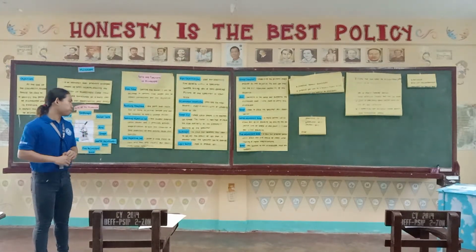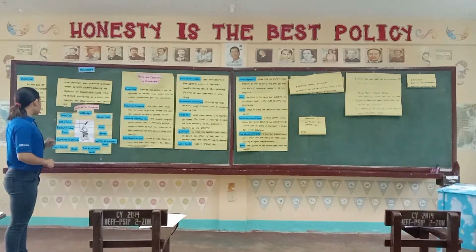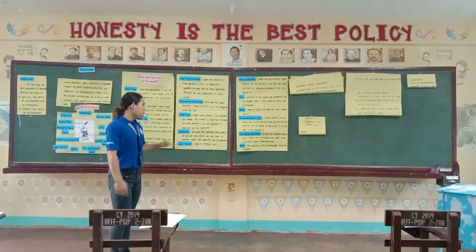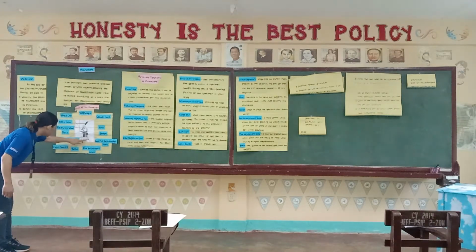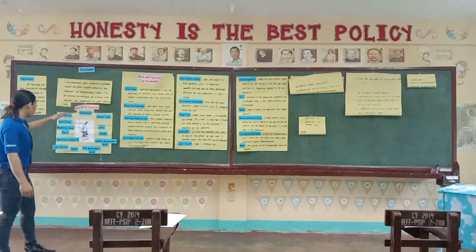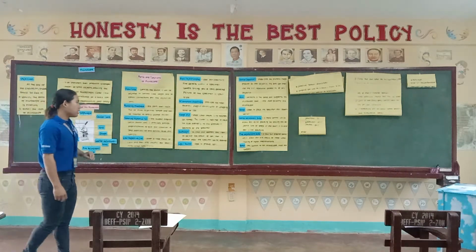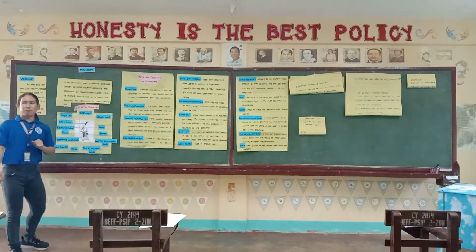Right? So, the last part of the microscope, we have the base or the bottom of the microscope used for support. Meaning, ang base, this one over here, the entire bottom part, is the base used to support the body weight of the microscope. So iyang gina-control or gina-supportahan ang body part sa microscope.